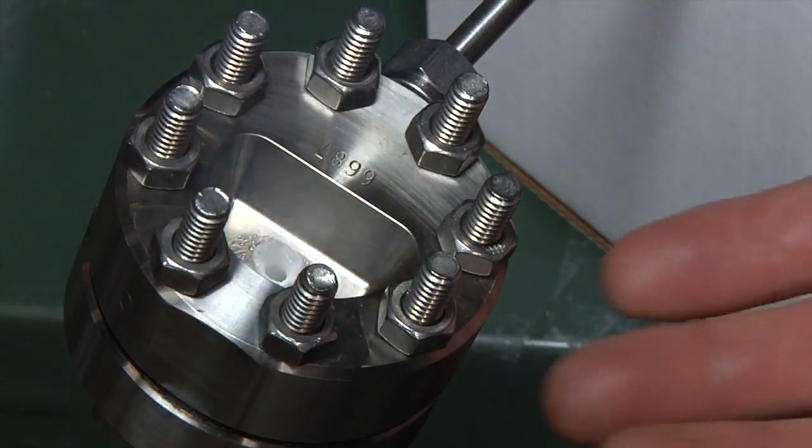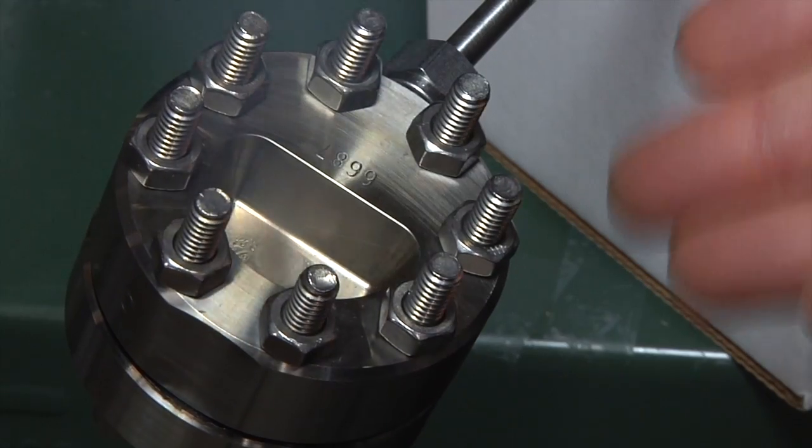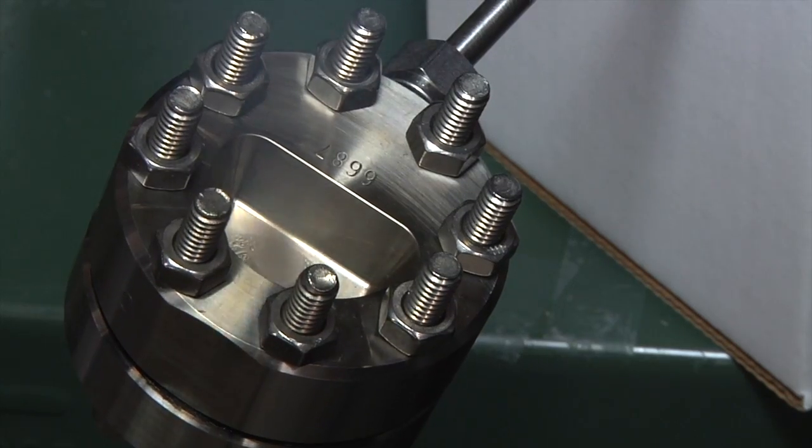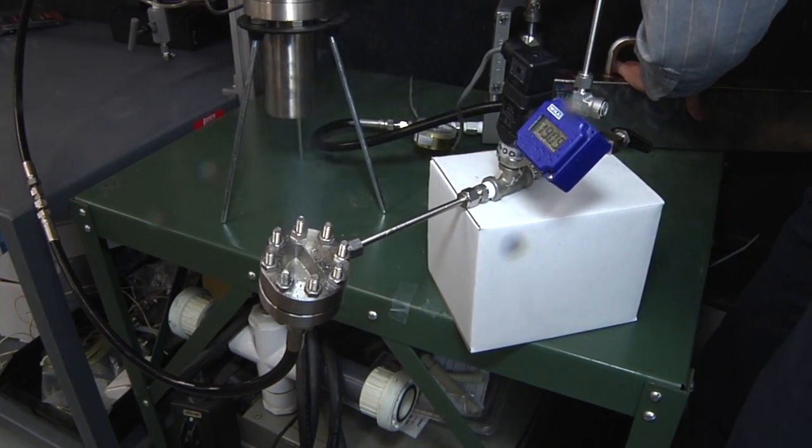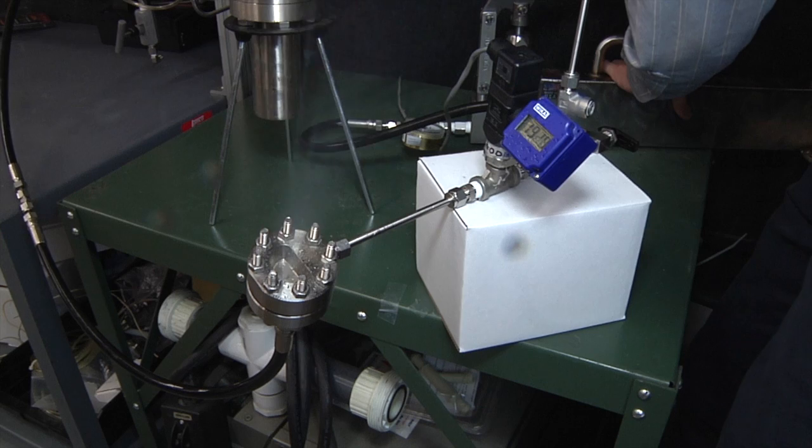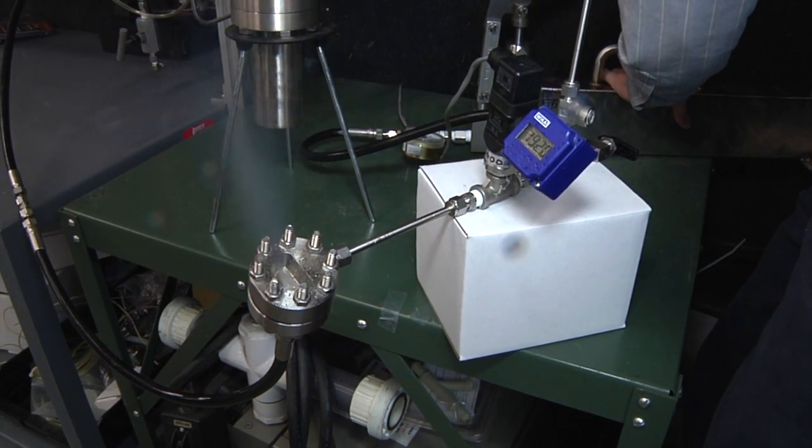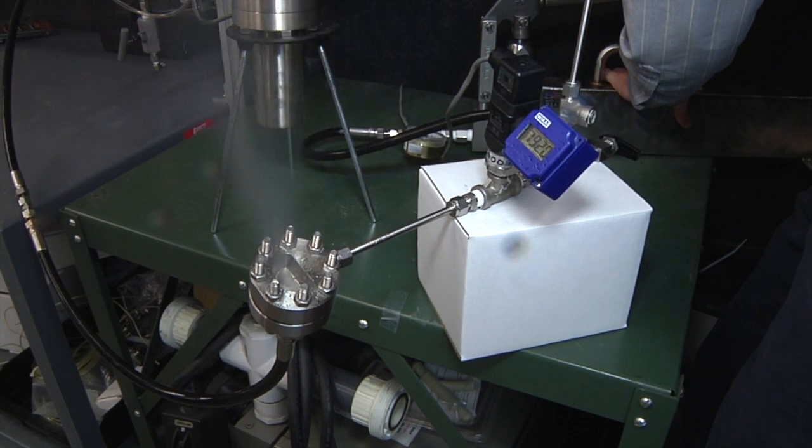So now that this regulator is highlighting not freezing well with supercritical, what we're going to do is exacerbate the problem by adding some water to the system. The pressure is still staying relatively constant at that half a percent variance across the full-scale range.